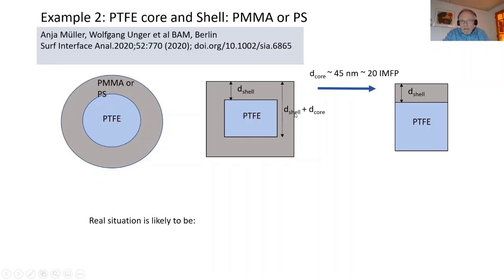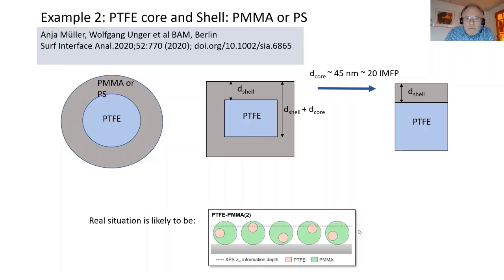and we could use this model here for the PTFE signal. So we look at the fluorine signal, and for that we can use this structure here. And of course you will have different orientations of the nanoparticles, which you can discriminate if you don't have an ideal coating where the coating thickness is constant in all directions.